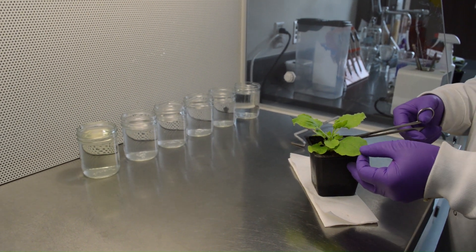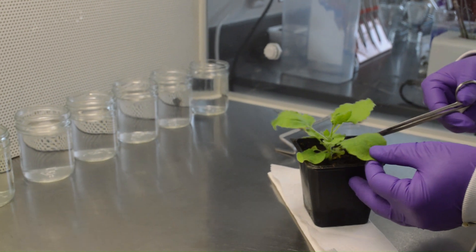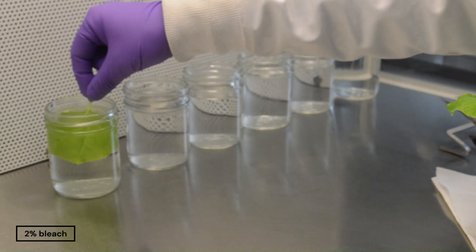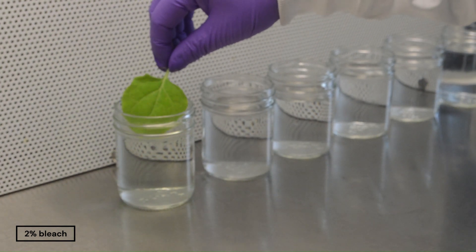Take the plant grown in the growth chamber for about one month or younger. Take a leaf and surface sterilize it in two percent commercial bleach for two to three minutes, followed by washing the leaf with sterile water five times.